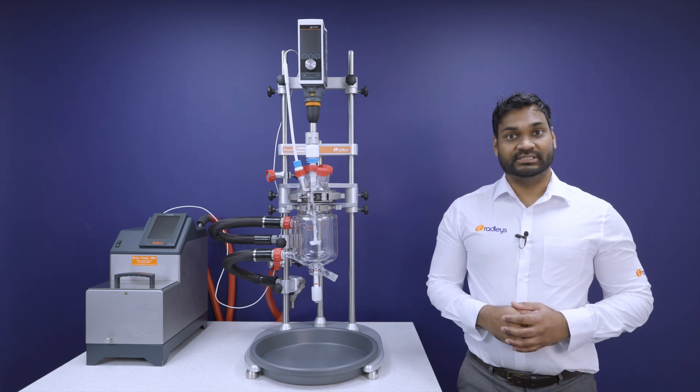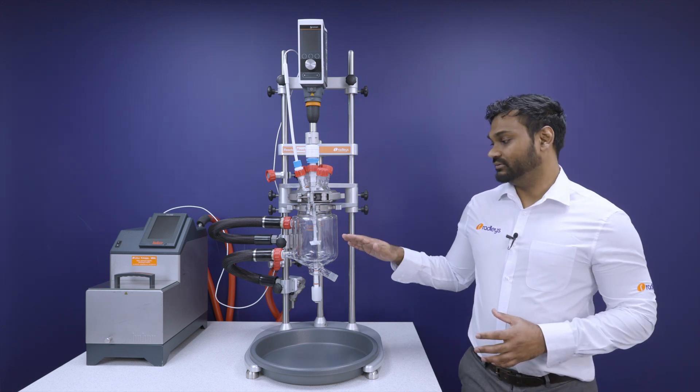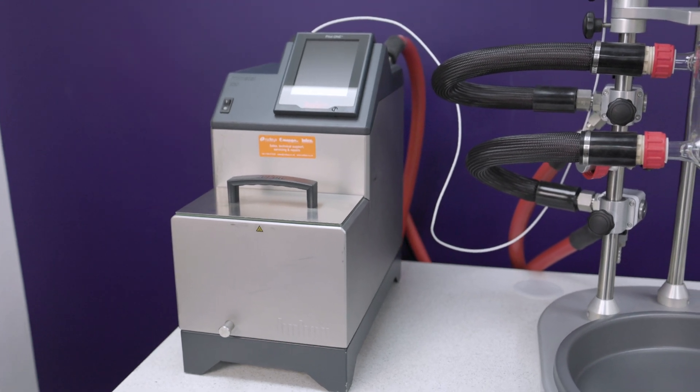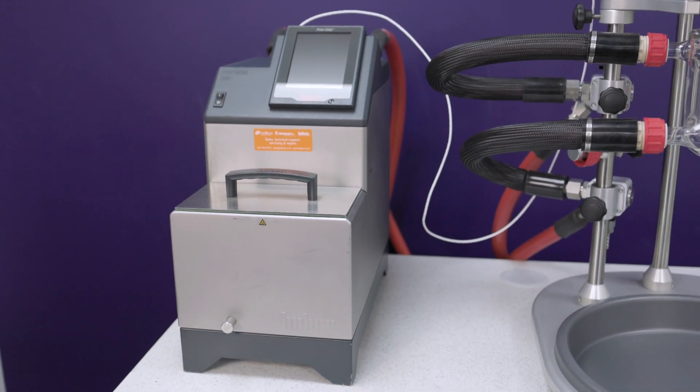Excellent temperature control is achieved by surrounding the actual reaction vessel with the jacket. A circulator, also known as a temperature control unit, heats or cools the thermal fluid and pumps it around the jacket.